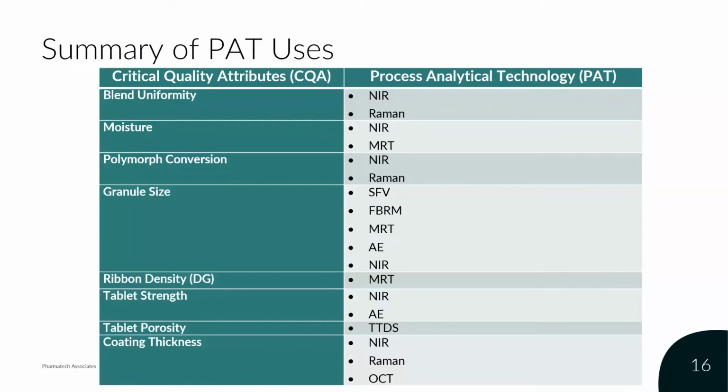So these technologies, and probes if you will, when properly calibrated and coupled with chemometrics, provide quality data for real-time release testing, either online or at line or inline.